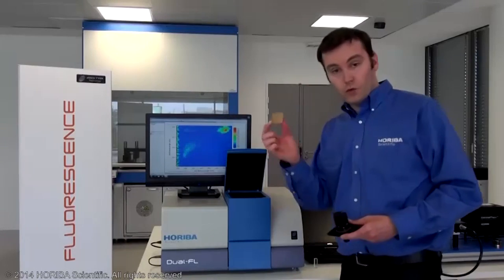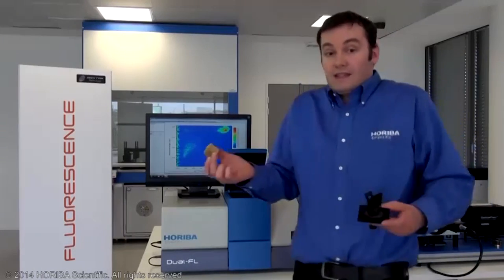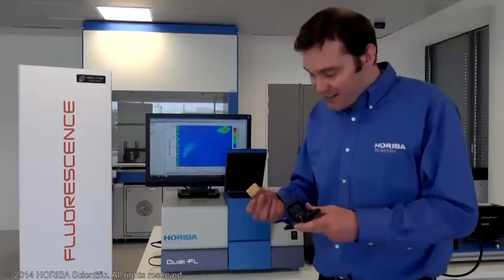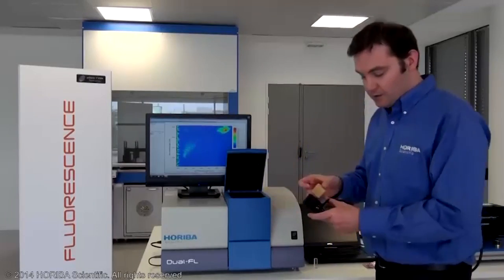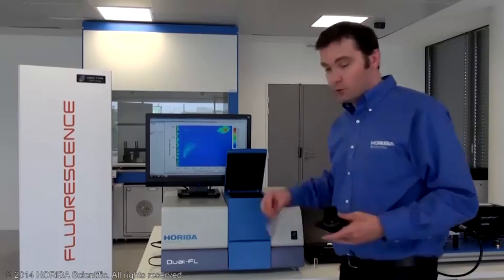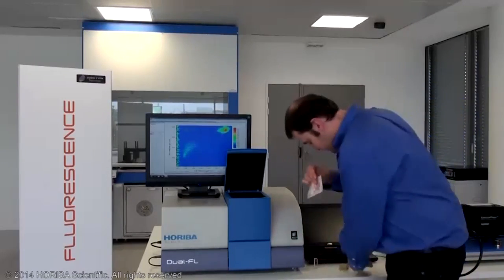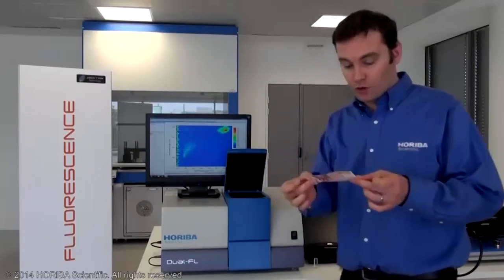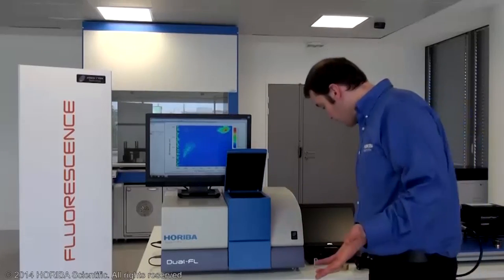You can have wood, of course, or a piece of paper. It could be anything, actually. So you can have a piece of wood like this, place it inside and make the measurement. Or it could be some euros from my boss. So you can make measurements on the banknote itself. Okay, so here we are.